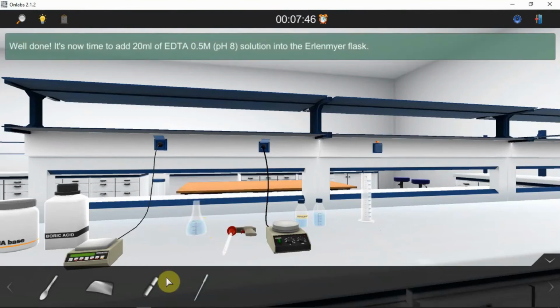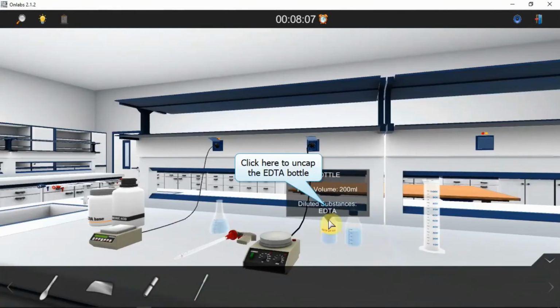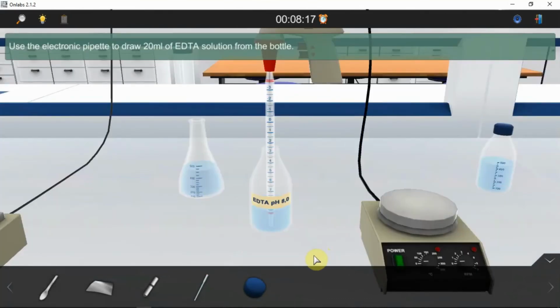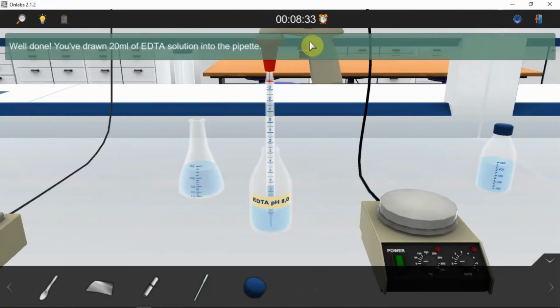Well done. It's now time to add 20 ml of EDTA 0.5 M pH 8 solution into the Erlenmeyer flask. Open the EDTA bottle by removing its cap. Well done. Now put the electronic pipette in the EDTA bottle. Well done. Use the electronic pipette to draw 20 ml of EDTA solution from the bottle. Well done. You've drawn 20 ml of EDTA solution into the pipette.